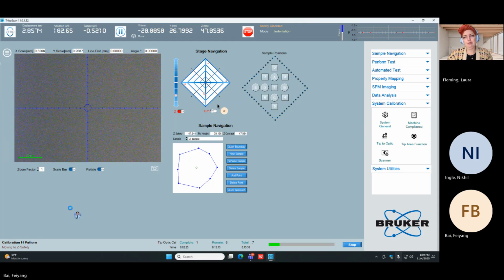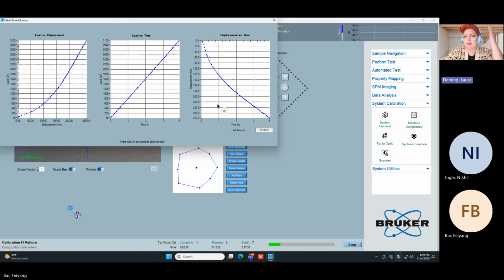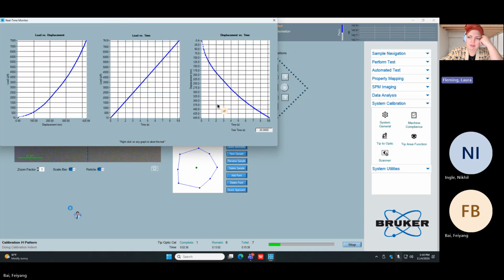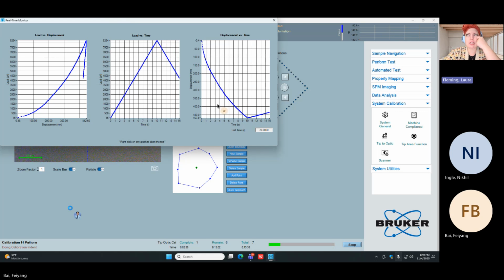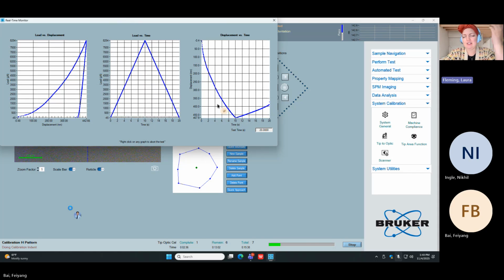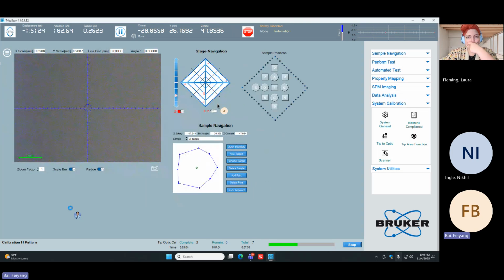That makes sense. Yeah, it's a little complicated, but that's why. Especially when you're first setting up a system like this, because there were no samples defined, the fly height was 0, which meant that you had to disable safeties to do anything interesting. That's why sometimes if you're trying to focus on a sample that's been predefined and you need to come down in Z, you're like, it's not focusing. It's because you have the safeties enabled still, and it won't come down below that because it's higher than the fly height. Okay. Yeah, this might take a while.